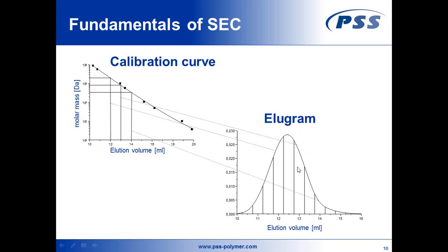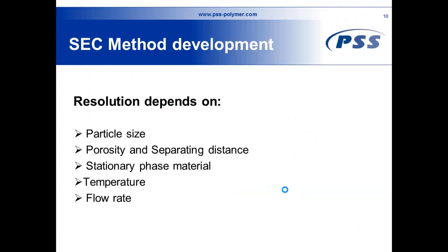Then you get all this information you're looking for, and not only the retention time or the elution volume.